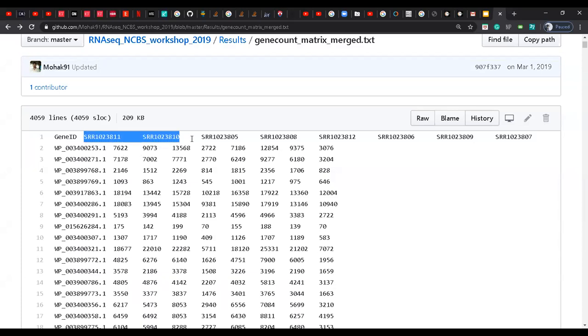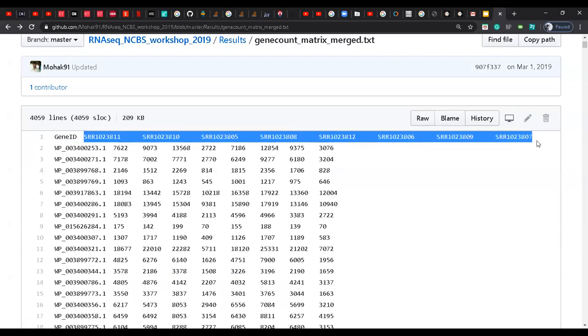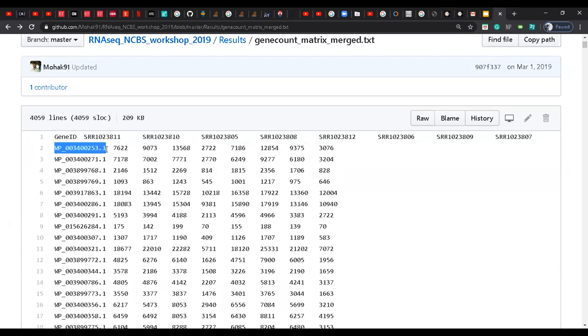So this is replicate 1 and 2. This is 3 and 4, so they belong to the other condition. This is the 3rd condition, and this is the 4th condition. So for each of these samples, what we are doing is, for each gene, because all of these samples are coming from the Mycobacterium tuberculosis reference genome that we had downloaded the first time, we are going to segregate the reads into different gene loci.